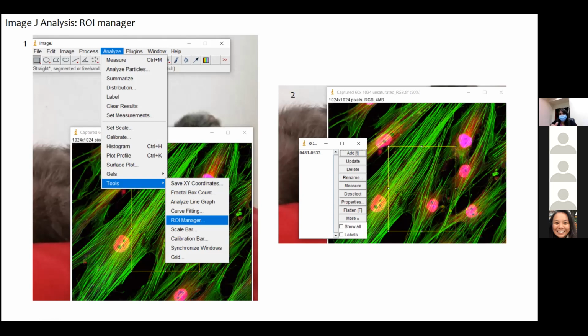But then if the reviewer asks or even looks at my data, I'd be like, are you sure? Because I could make that square even here and I would get the same kind of intensity. So again, you want to be careful when you are presenting images, especially fluorescence images. Actually, any kind of images.